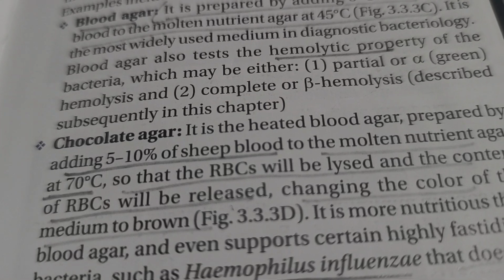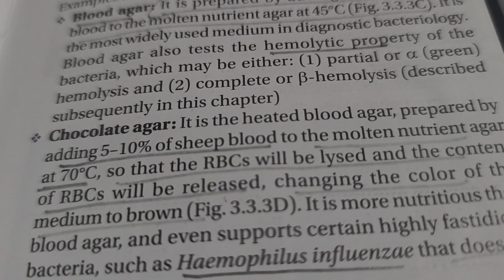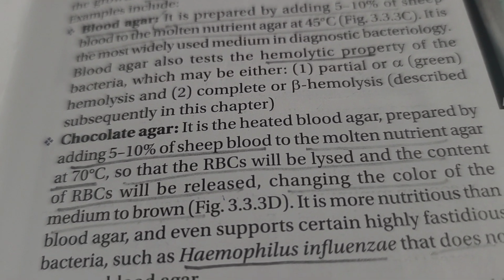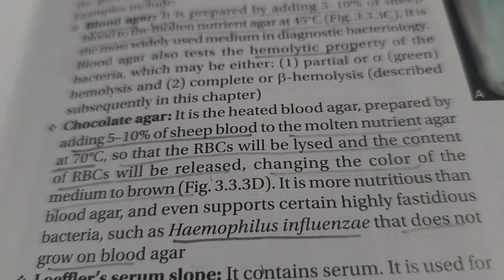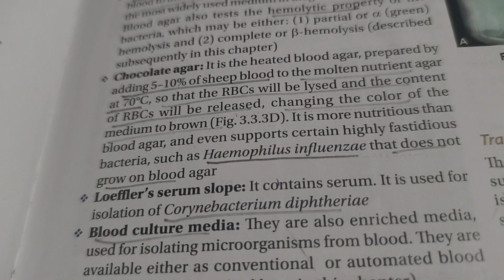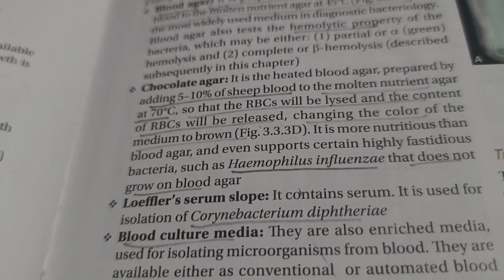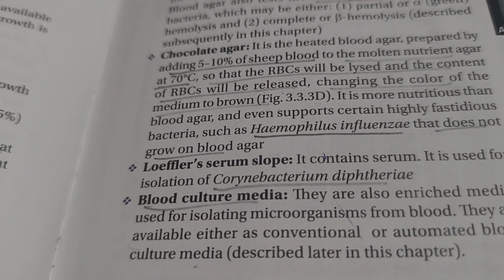It is the most widely used media in diagnostic bacteriology. Blood agar also tests the hemolytic property of the bacteria, which may either be partial or alpha green hemolysis, or complete or beta hemolysis, described subsequently in the chapter.